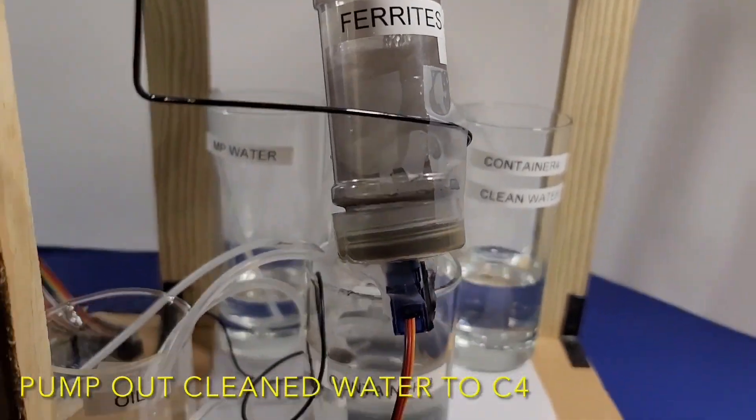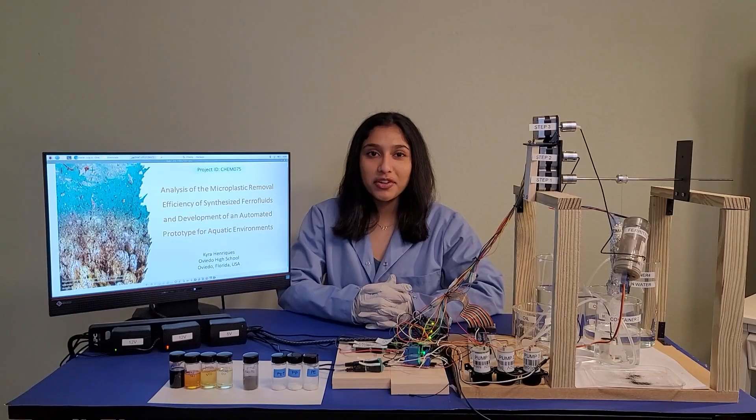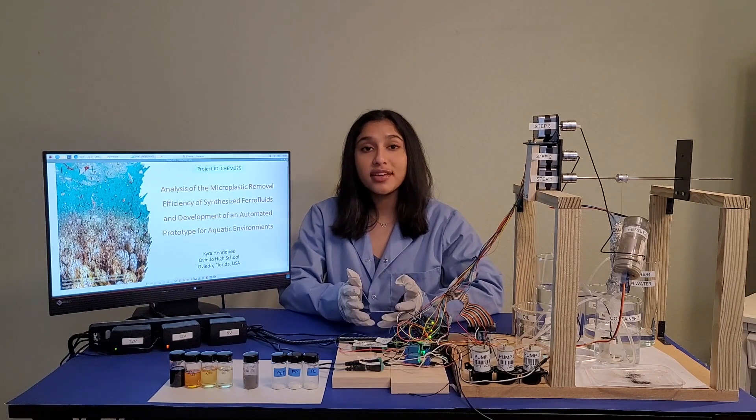The electromagnet is then moved back to its original spot and the clean water is pumped to container 4. After running my prototype for a total of 5 trials for all 3 microplastics, a greater than 85% magnetic removal efficiency of the microplastics was observed. When scaled up, this is something that can be implemented in real world environments.